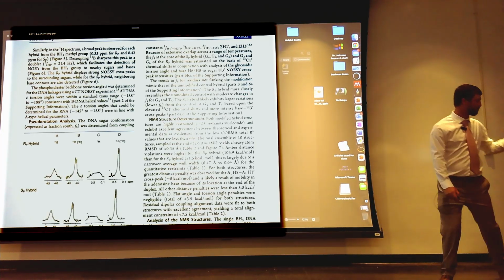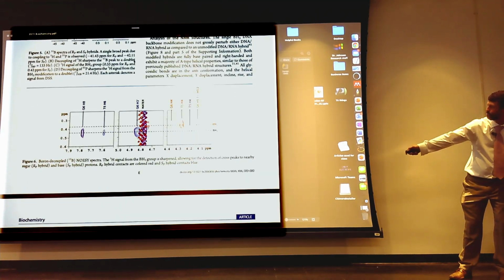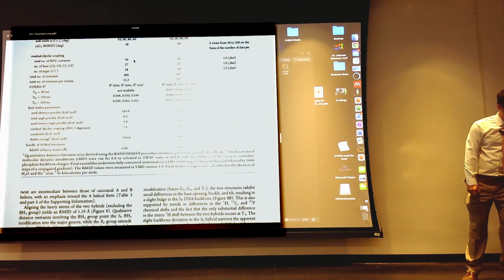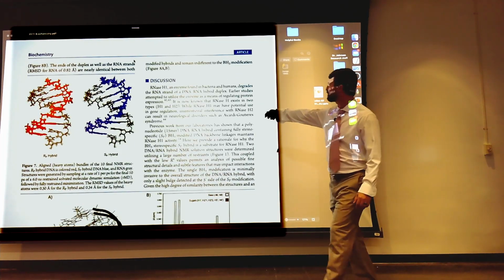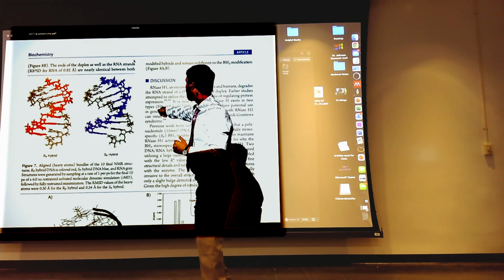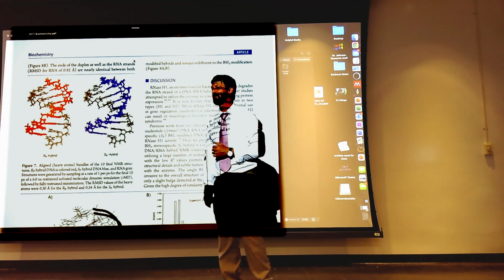You can correlate those boron peaks to other parts, and you could see here's the primary data where this is different. That boron was oriented in a different way. And ultimately, at the end of the day, I was able to determine NMR structures. You can look at the two structures, and what wound up being different is the decoration of the borons along the side changed the ability for the enzyme to grab onto it. And so the R enantiomer form was less effective than the S at accommodating the enzyme.